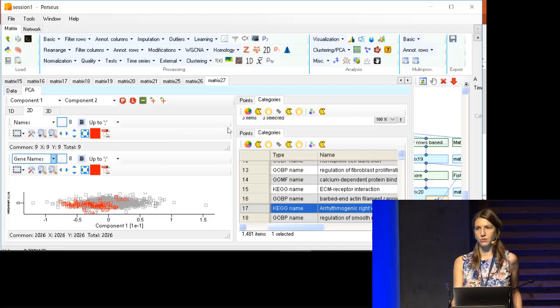Can you describe a bit what you mean by batch effect? For instance, I have 2 conditions, but they were cultured at different times, so batch 1 and batch 2. I make this multidimensional scaling plot, similar to the PCA plot, and I can still see that there are batch effects.